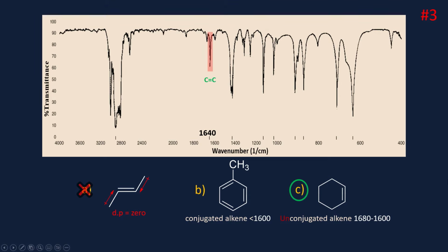For C, it should be weaker than that of B, because in C there is only 1 carbon-carbon double bond, while B has 3. And also, C is a nearly symmetric alkene. But some will say, isn't it a symmetric alkene? Actually, its true form is not this form. Its true form is the chair configuration you could be familiar with in stereochemistry.